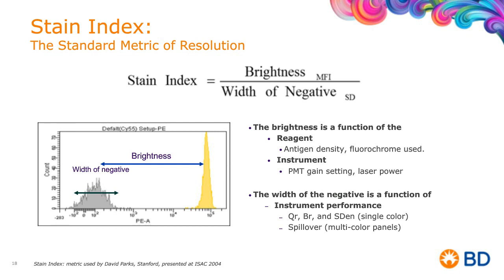And if there are very few receptors, let's try to use a color that is much brighter than others. But that only goes so far, because you still have to be careful with spread. But if we know something about that receptor density, it does help us. And it's one area that if we pay a lot of attention to, we can correct panels if we know that information.